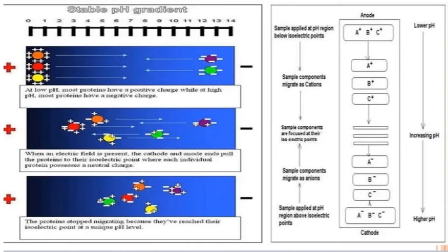So now the second medium is indicating that it is the orange one we are tracking only. Let's try to observe how the yellow one is moving. So now the yellow one is moving towards the cathode, and there is something we need to observe there. The charge is changing. Instead of it having only positively charged ions, we've now seen the introduction of negatively charged ones as it is moving. If we have a look at the last one there, let's observe how many charges. We have two positive charges and two negative charges.